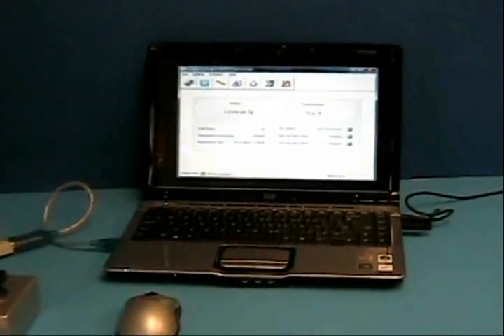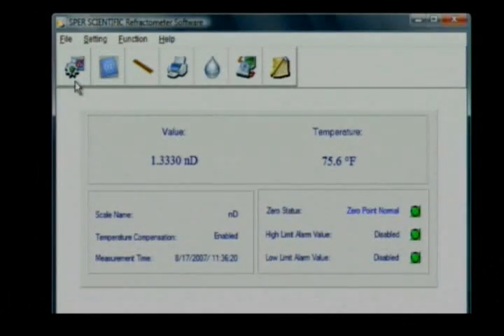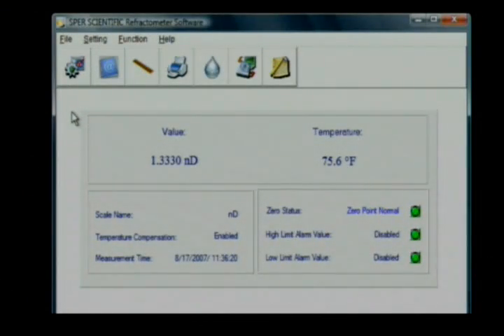You can also use the computer software itself to read the refractometer when the two are connected.